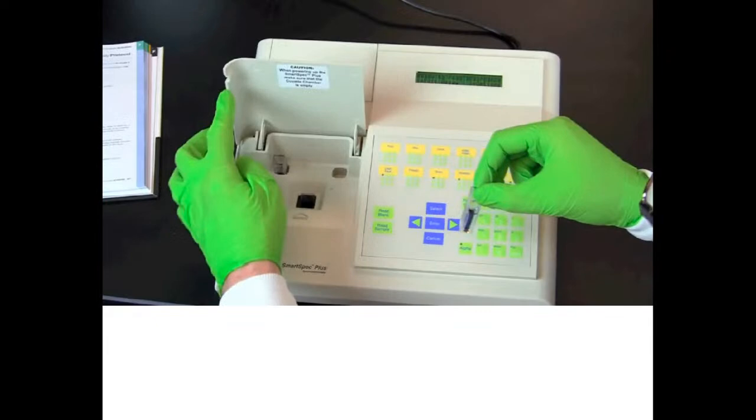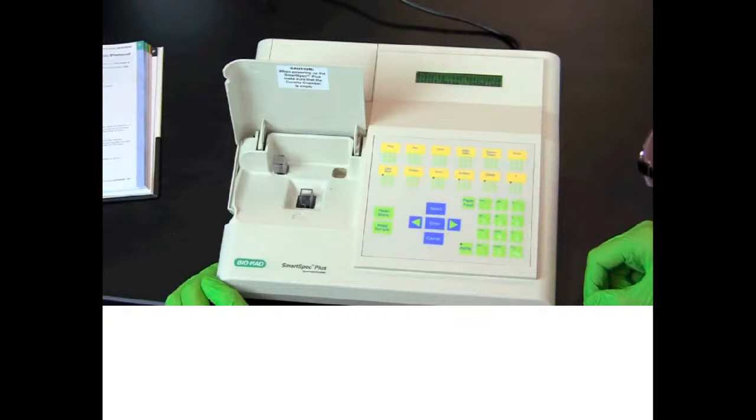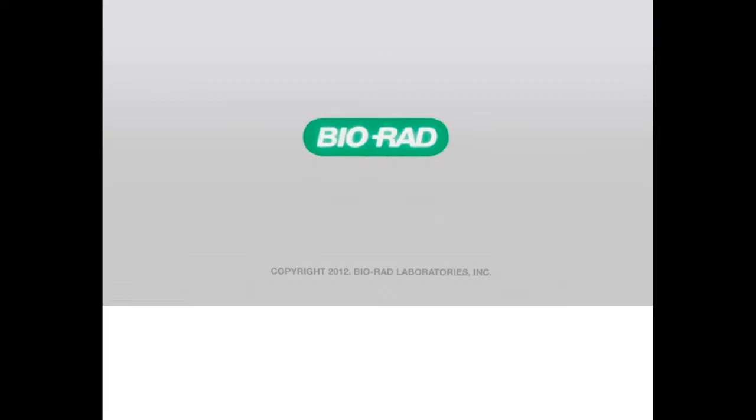If instructed, read the absorbance of the 7 protein standards and record the absorbance values. Remove the cuvette labeled blank and insert the milk sample into the spectrophotometer. Read the absorbance and record the value. So, very simple method.